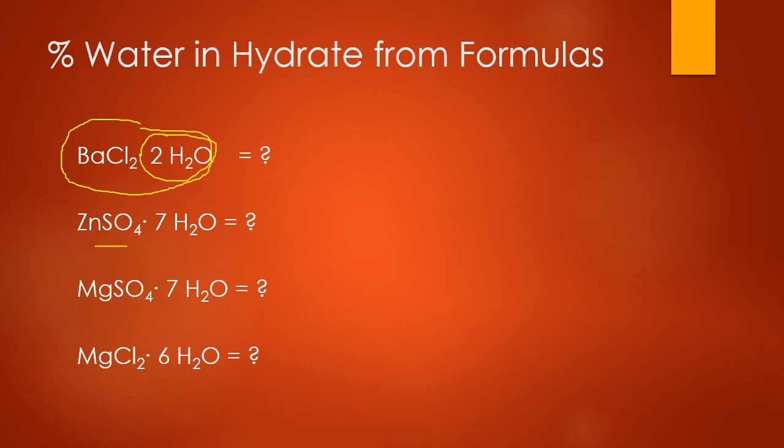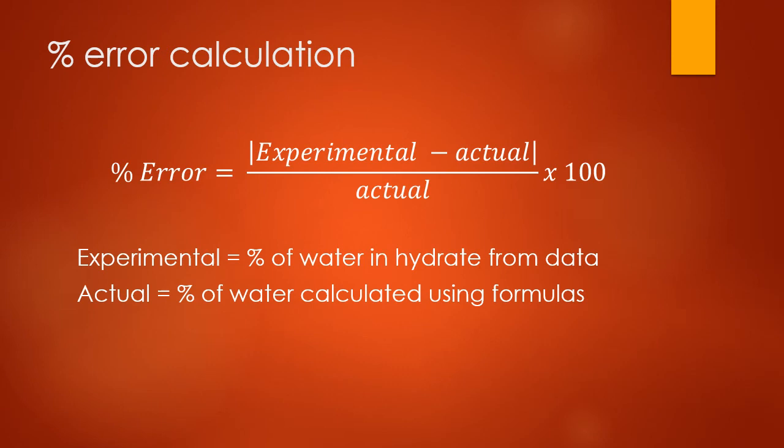Once you have completed that for all of the possible unknowns, compare what you got with your experimental data to the percentages calculated here, and then identify which unknown you have. Once you identify the unknown that you have, you will write it in the blanks provided and then calculate the percent error for the experiment.